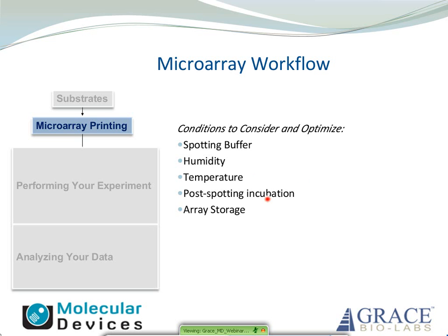Post-spotting incubation should be assessed for each application and may be necessary for optimal binding to some surfaces. For example, NHS ester chemistries typically require an overnight incubation at high humidity to complete the binding reaction. In addition, storage post-arraying should also be assessed, as labile proteins may lose immunoreactivity during storage. I won't discuss this today, but I will explore this topic in more detail in our 3rd webinar of this series.